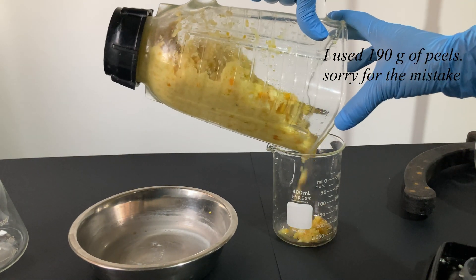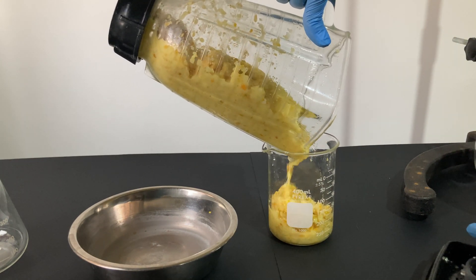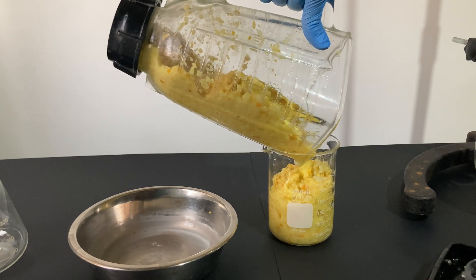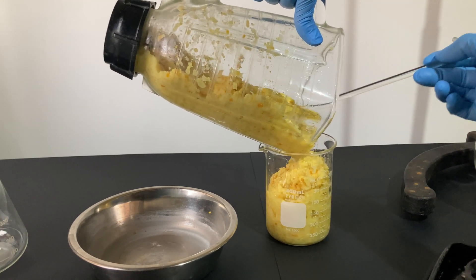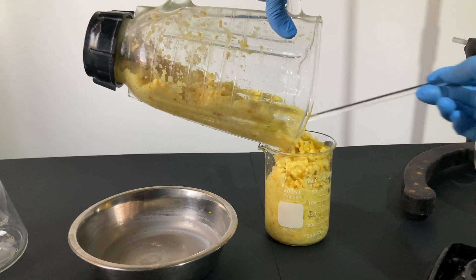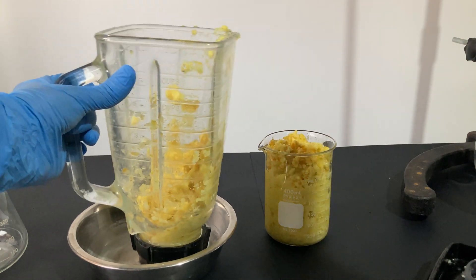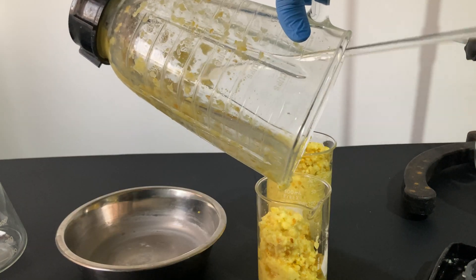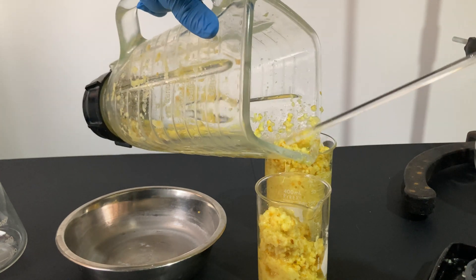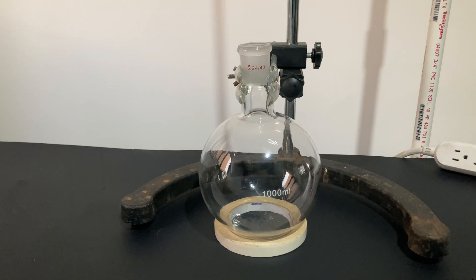The mixture was then transferred to a beaker. Now that I think of it, this step was kind of unnecessary, as I could just transfer everything from the blender directly to the boiling flask. But, as if using a beaker was not wasteful enough, I decided to use two beakers instead, because I thought a huge 700 milliliter mixture could fit into a tiny beaker. Anyway, let's move on.